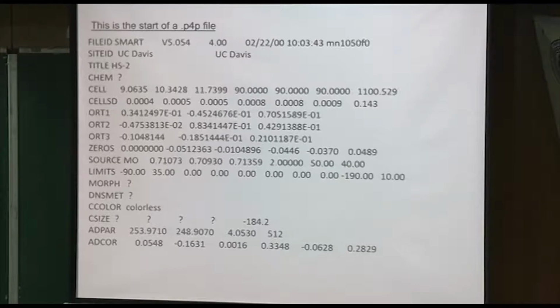Now, standard deviations, maybe I'll just mention that now. The thing that you put in parentheses there at the end of pretty much anything should range between 2 and 19.